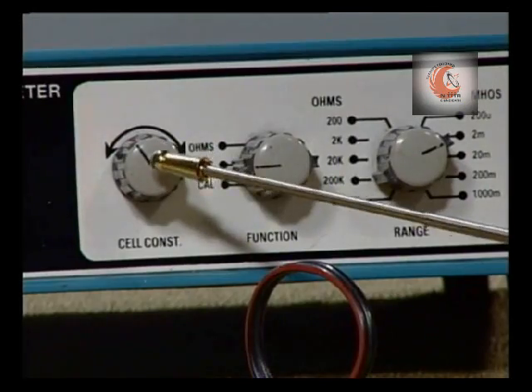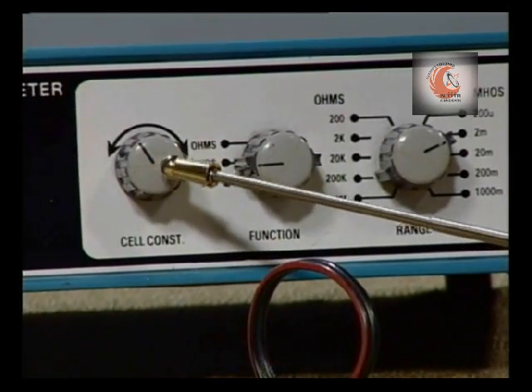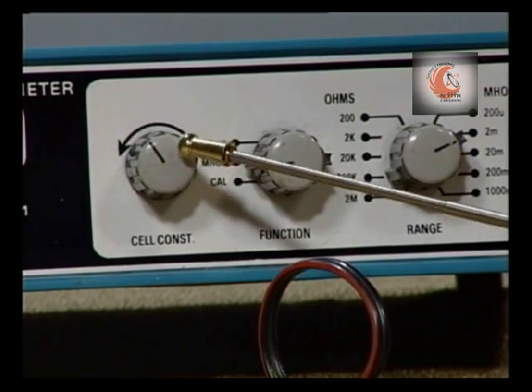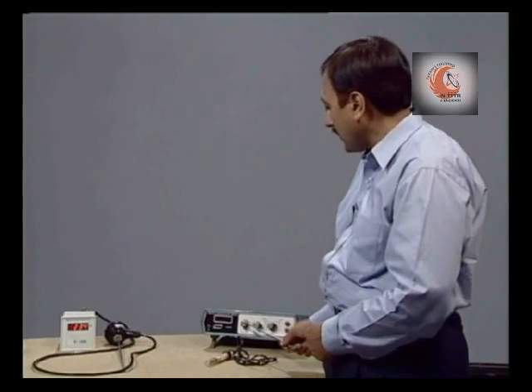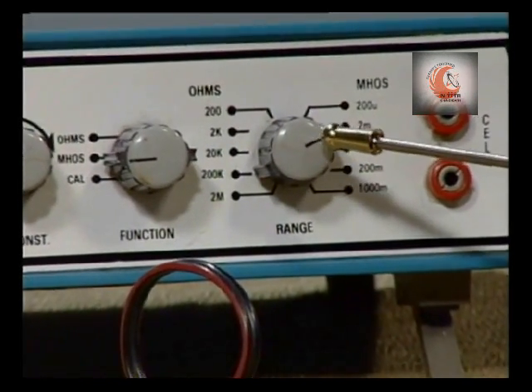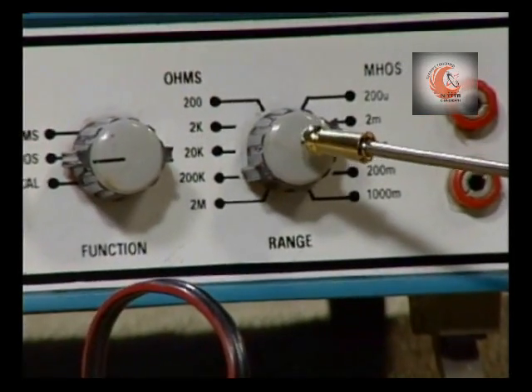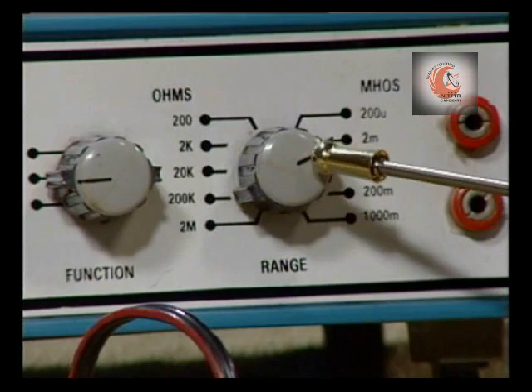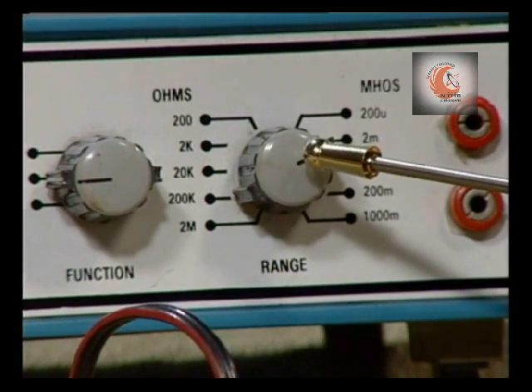The cell constant knob is used for synchronizing the conductivity cell with the instrument. The third switch, called the range switch, is used to select the appropriate range of conductivity depending on the expected value of conductivity in the sample.